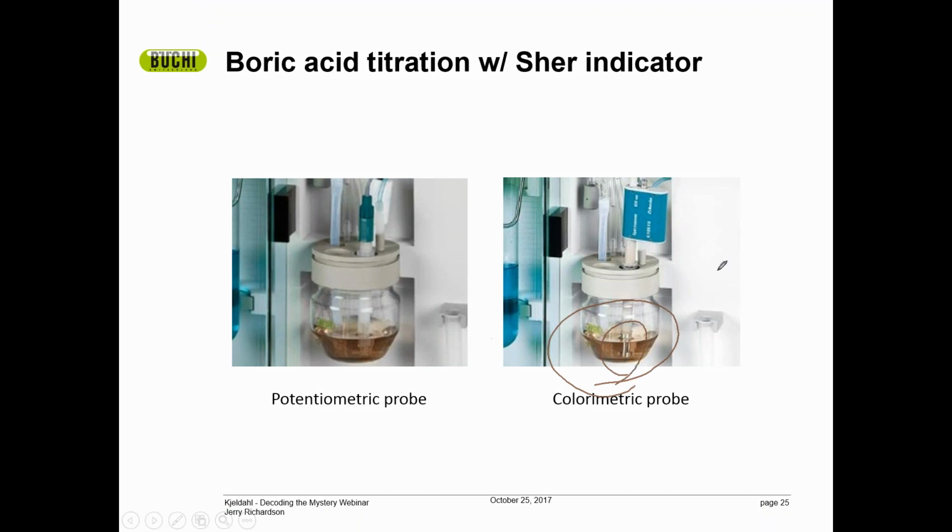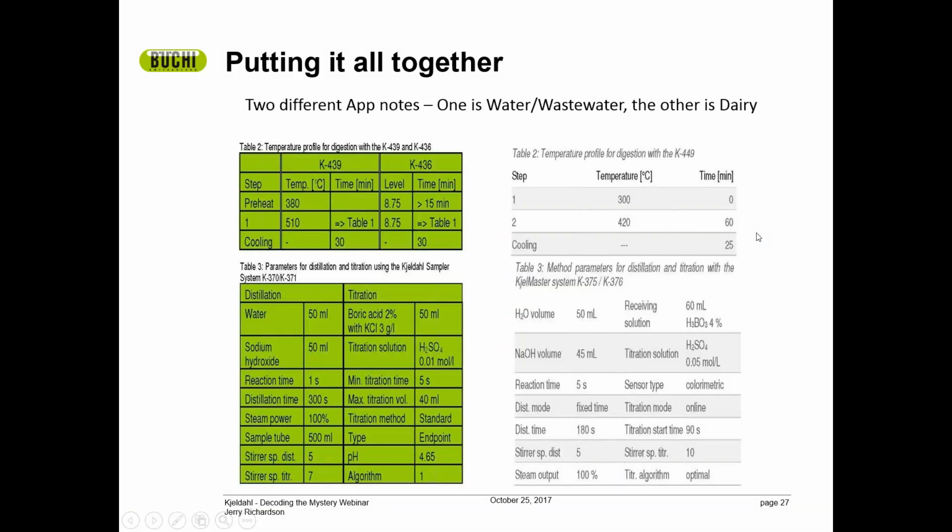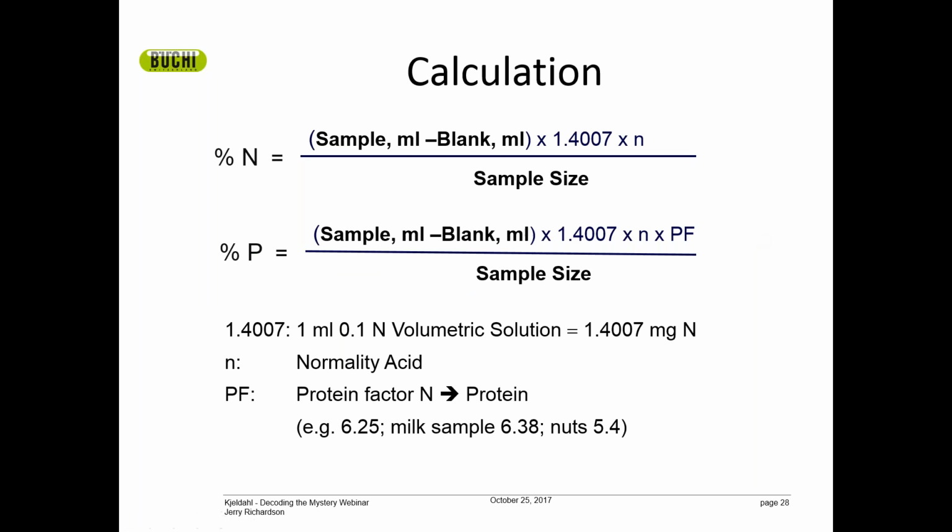With the liquid needing to be mixed very well, the one thing we want to do is go through that wire mesh very quickly and easily, and the way to do that is to increase that speed.